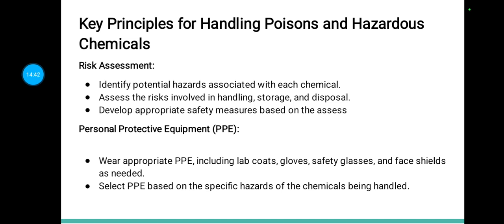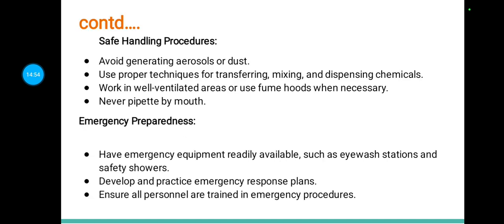Let's come to PPE, personal protective equipment. Wear appropriate PPE, including lab coats, gloves, safety glasses, and face shields as needed. Select PPE based on the specific hazards of the chemicals being handled. Safe handling process. Avoid generating aerosols or dust. Use proper techniques for transferring, mixing, and dispensing chemicals. Work in well-ventilated areas or use fume hoods when necessary. Never pipette by mouth.